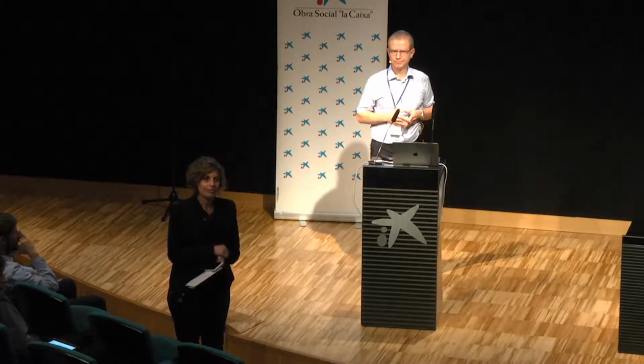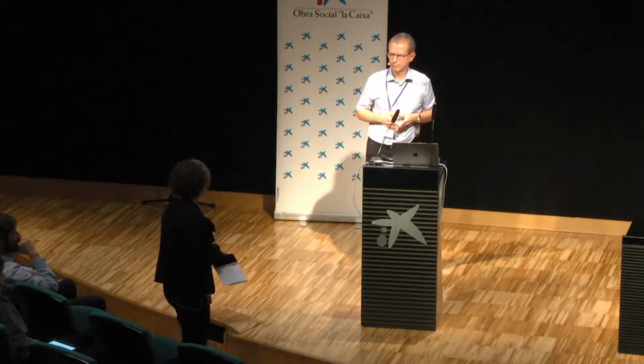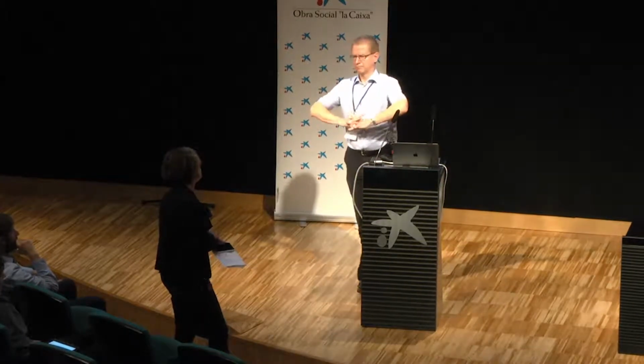Questions for Mats? So how easy is it to adapt this method across different tissue types, and can you do FFPE?